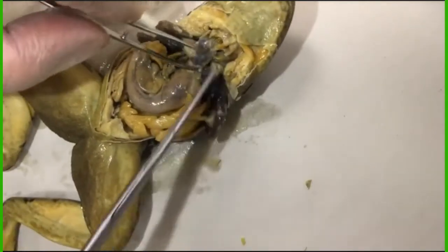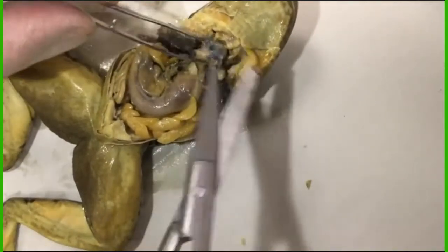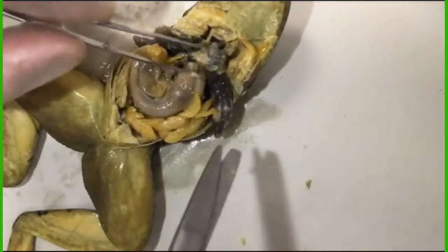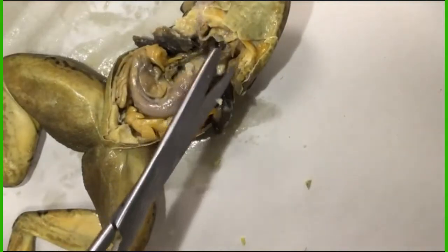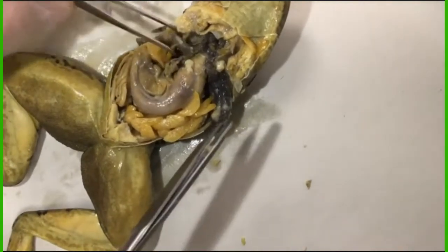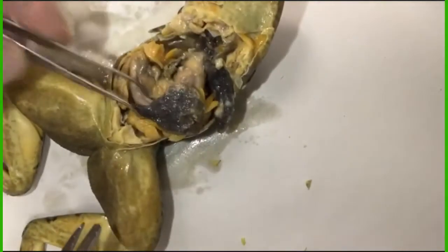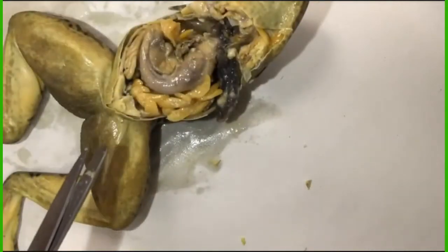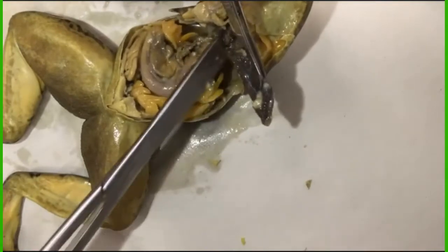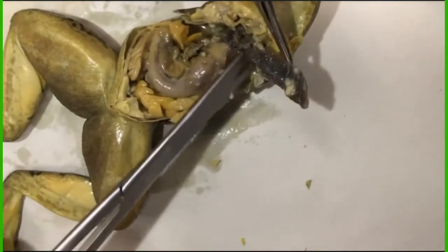The frog heart only has three chambers. It's got two atria, those are the top chambers, but it only has one ventricle, that's the lower chamber. Whereas we have two ventricles, so we have a four-chambered heart, and they have a three-chambered heart. There it is, that's the heart. All right, there's one lung, we're going to snip that out of there. Very spongy, grayish looking organs. There's the other one, we're going to snip that out of there.